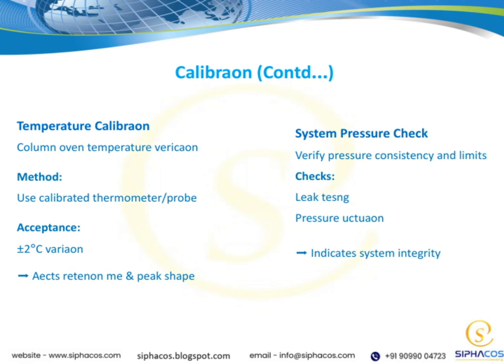Now, for calibration, this process continues throughout the analysis. Regular checks and adjustments ensure our system remains precise. Remember, maintaining proper pressure and temperature calibration is fundamental to achieving consistent, accurate, and reliable analytical results.